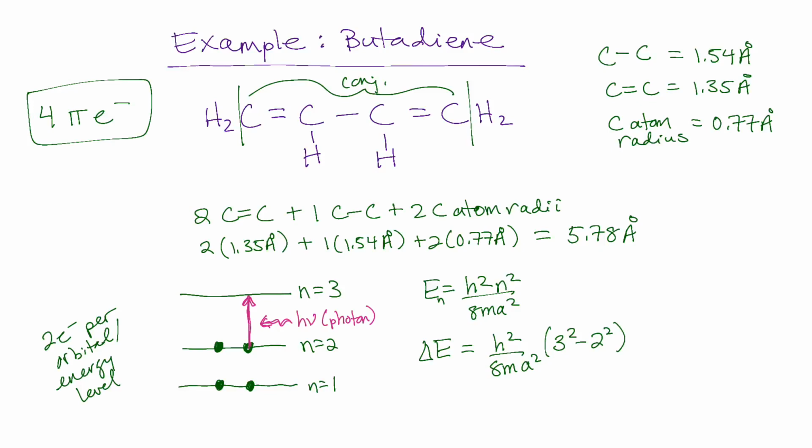And then that value, remember, delta E equals h nu, or hc over lambda. If you want to calculate the frequency or wavelength associated with that transition, those are the relationships you want to use. These are the equations for spectroscopy, calculating frequencies and wavelengths, that you want to really have handy in your mind.